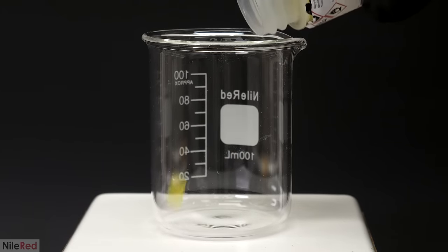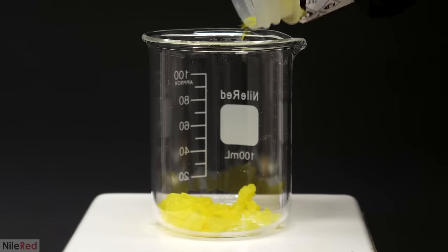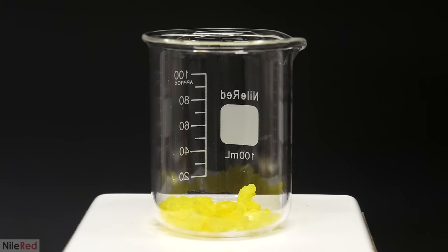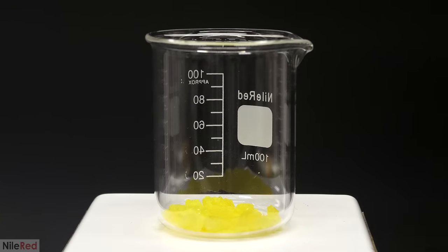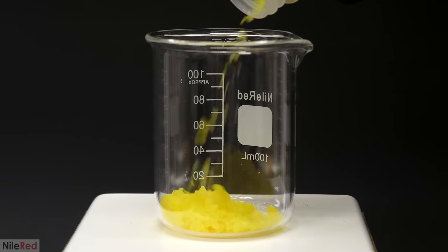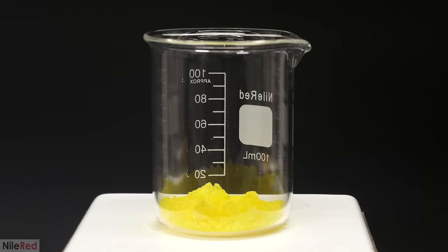To get started, I had to add the uranyl nitrate to a beaker. Normally I would have just quickly weighed it out on some paper and dumped it in. However, this time I was working with a uranium compound so I had to be a lot more careful. The dust it could let off is not only radioactive, it's also toxic and can lead to heavy metal poisoning. So to be as safe as possible, I carefully weighed everything directly in the beaker, and in total I used about 15 grams.